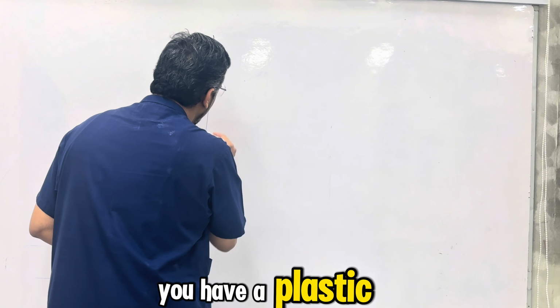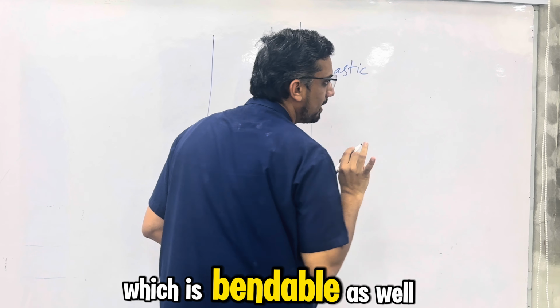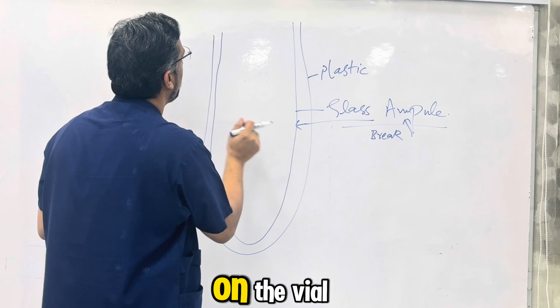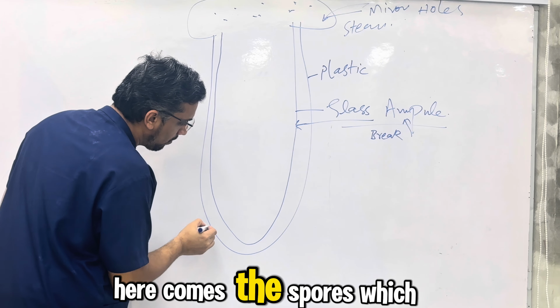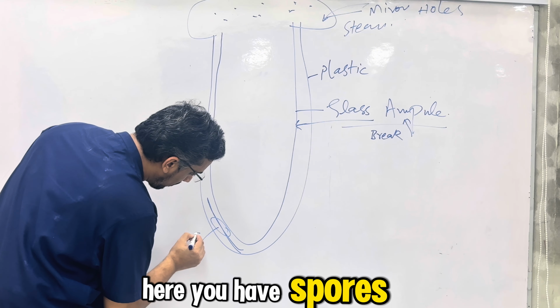You have a plastic vial, which is bendable as well, and you have a glass ampule over here. This glass ampule will break when you apply pressure on the vial, and on the upper surface you have the cap, and in this cap you have minor holes through which the steam penetrates. Here come the spores, which are placed on some paper. Here you have spores.